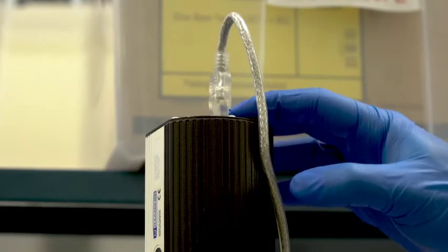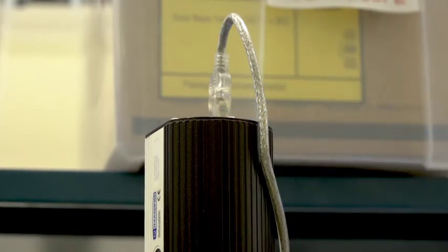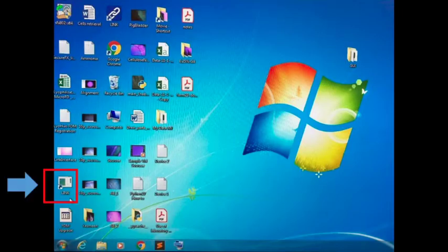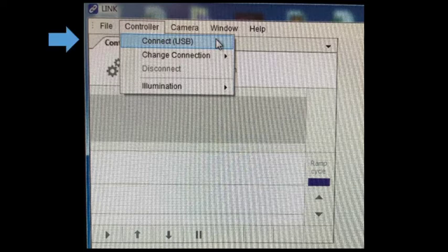Turn on the microscope camera using the switch located on the top surface of the device. On the lab computer, open the Link software on desktop. Navigate to the controller tab in the toolbar and click connect.